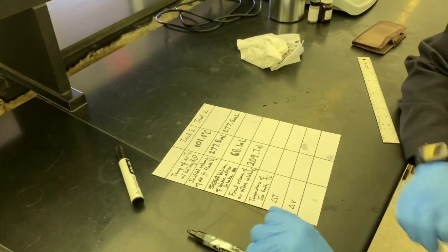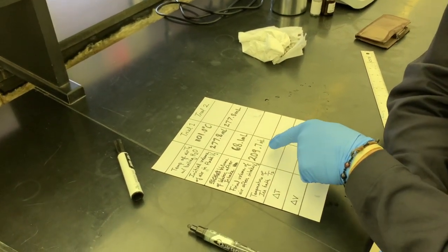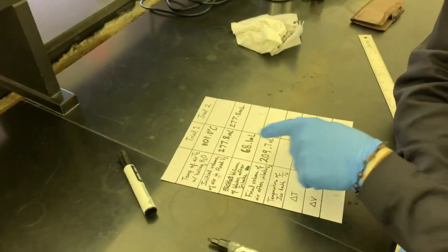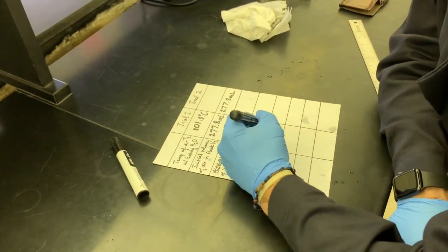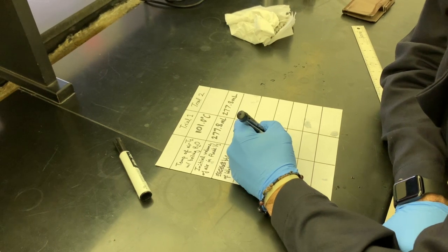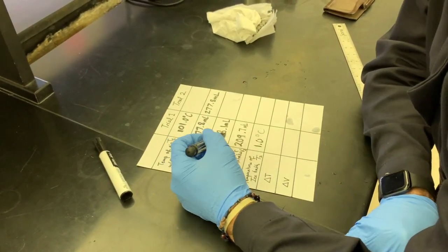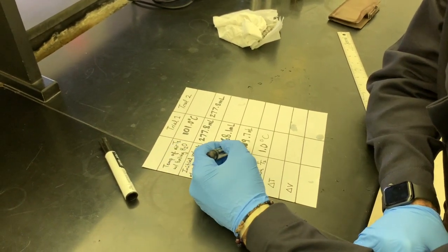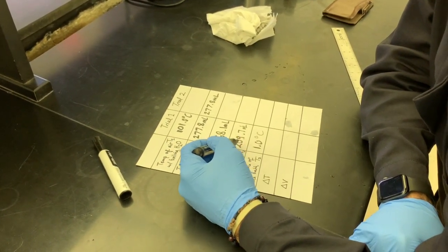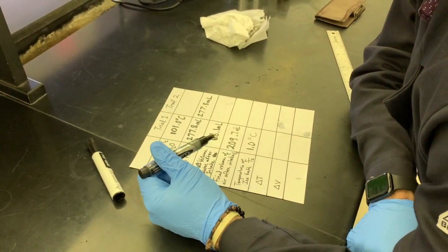Okay, so what we saw here was the temperature went from 101.0 degrees Celsius to, we measured, 1.0 degrees Celsius. And in that time, we went from 277 milliliters to 209.7 milliliters. So we're gonna do that one again, and then we're gonna be calling it good.